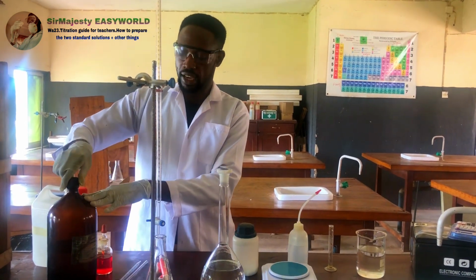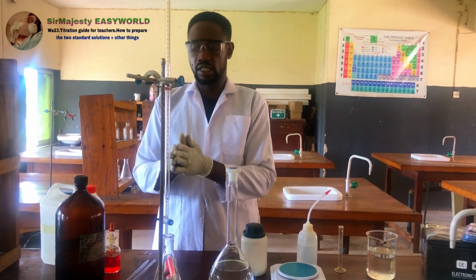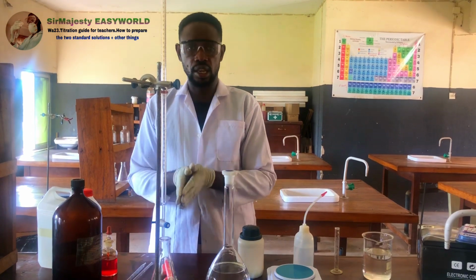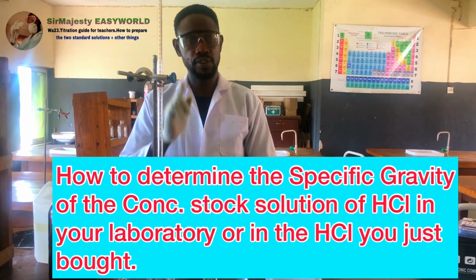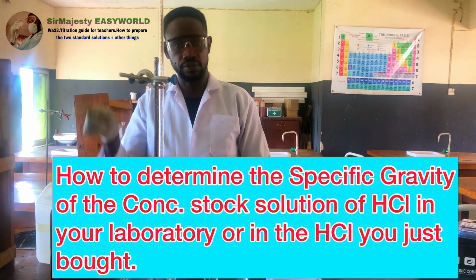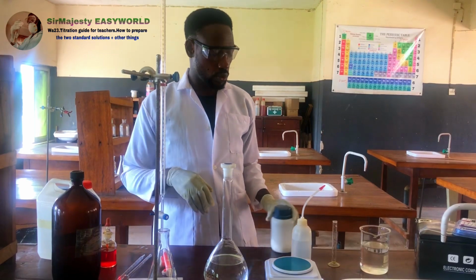Sometimes, being a volatile acid, if you open it, you see fumes going out, and as the fumes go out, the concentration tends to decrease. So what must you do here first? I want to teach you how to know the specific gravity of the HCl you are using. What you need to do is forget what they labeled there and check if it is still what it is.